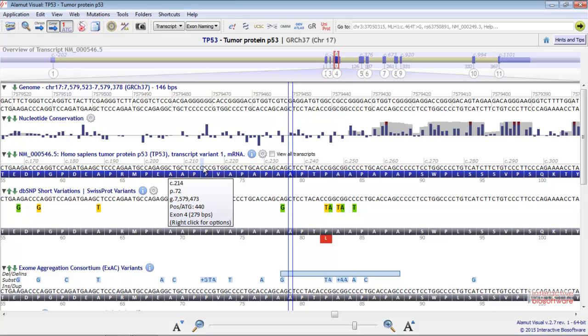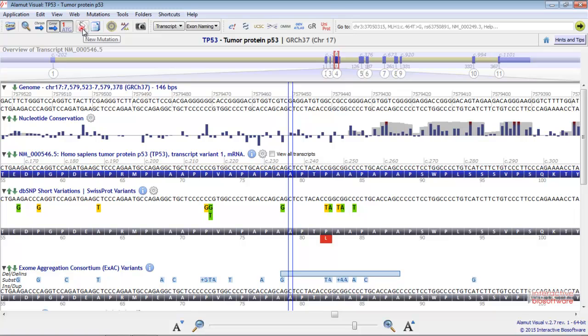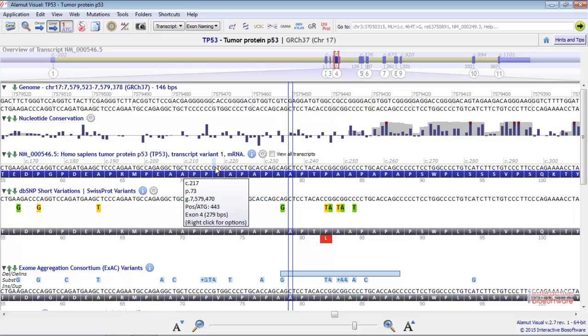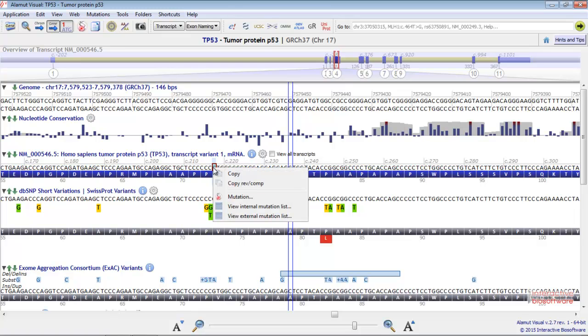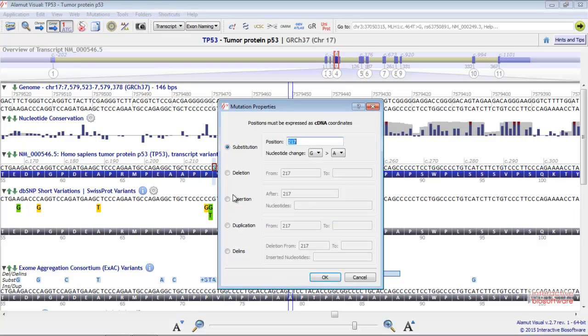In order to create a mutation, you can directly click on this button at the top of the screen, or just select a nucleotide, click with the right button, and select mutation.